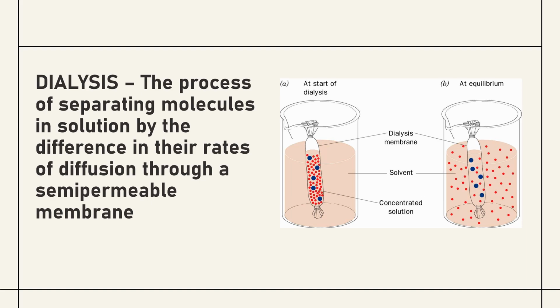Okay, and so in the activity, we utilized solutions of sodium chloride and starch solution. We placed it in a cellophane, tied it, making sure that it will not leak, and placed it in a beaker that contains distilled water. Okay, and so after that, we set it aside and let it stand for 1 hour.